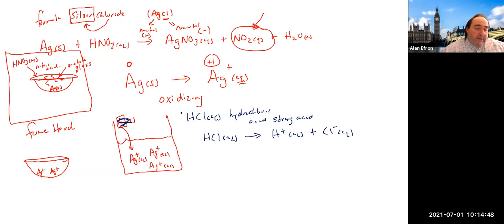So when we do this and we toss the HCl into the evaporating dish, we're now basically adding to that solution a lot of H pluses, but we are adding a lot of Cl minuses, which are also aqueous and also floating around. And now we have silver ions there, we have chloride ions there. And as we'll talk about in a later chapter, those two guys have a very good attraction to each other. They want to come together and actually make a solid.